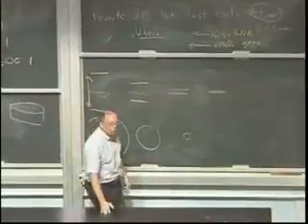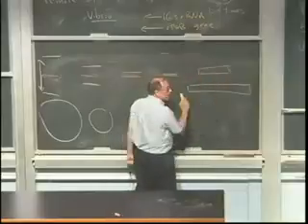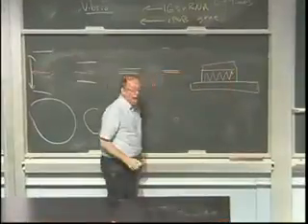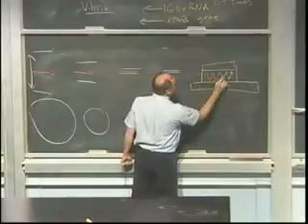Now, what happens, and you may not realize this, I never realized this until I started teaching. When we have that slide like this, when we have that cover slip, there's actually a large column of liquid here. So those specimens can be anywhere in that column of liquid. So if I'm trying to use a high power, my depth of focus, that section, is so thin, I may not see specimens that are there.